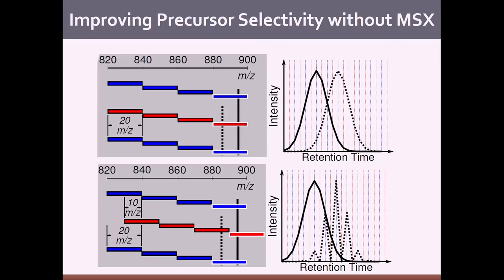So one of the issues in microscopy, for a very long time, has been how do you obtain the ability to image things within a cell at smaller sizes than the wavelength of light, right? Previously that wasn't possible, but then super resolution microscopy came about, and what they did is they were imaging at smaller intervals than the wavelength of light, so they were able to reconstruct what the object was, even though the object was smaller than the wavelength of light.